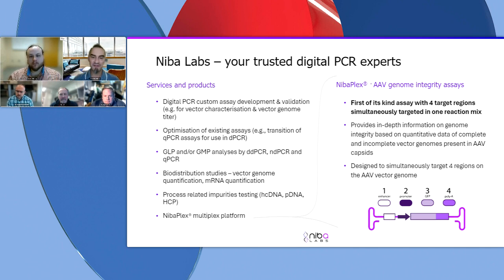Yeah, I must admit here that this newer software version with this color compensation matrix definitely helps, because we have seen in the past there was some bleed through with channels, and then suddenly instead of 4 channels in 2D view, you're getting 6, and they're positioned in various ways. And then it became quite complicated for, let's say, an unskilled user to know where to set the thresholds appropriately.